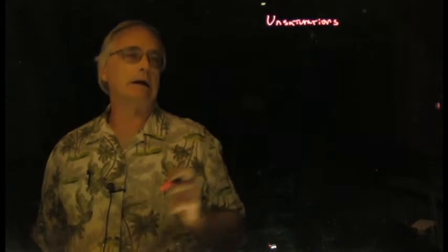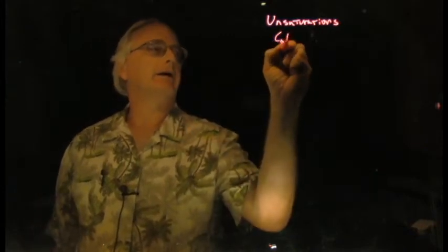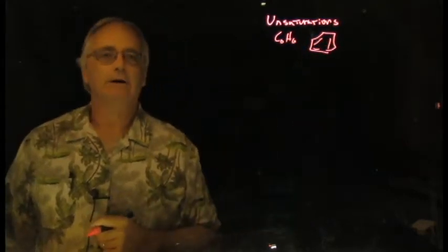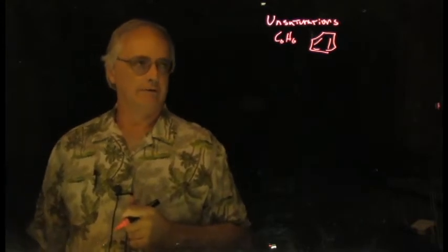So one thing to think about when you are doing this type of work and you have the formula is that one of the most critical things is the unsaturations. If you know the formula, or you can derive a formula from other information, you can calculate the index of unsaturations. Remember from your basic organic chemistry, an unsaturation is a pi bond or a ring, or a combination of both. Classic example, C6H6, benzene, with that structure, alternating single and double bonds traditionally drawn.